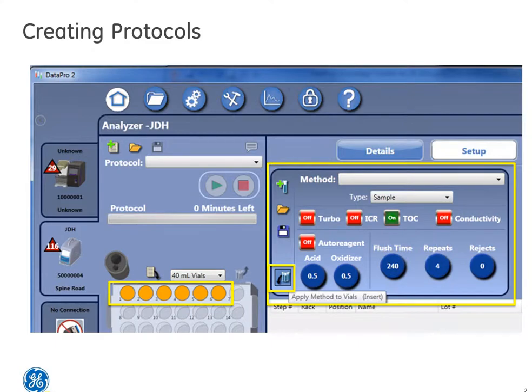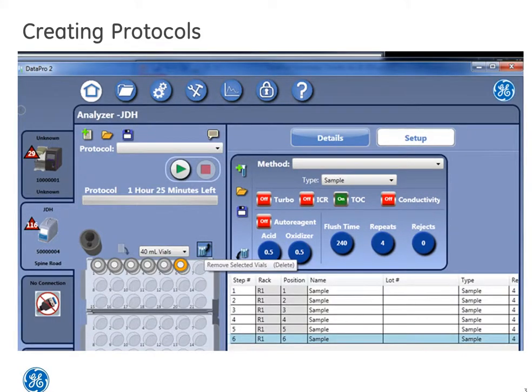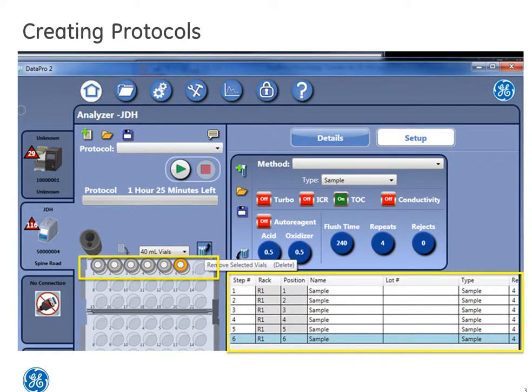After assigning the methods to the protocol, the vials in the auto-sampler rack display will change color to gray, and the results screen will auto-populate. However, if you need to make some edits on sample name or add a lot number, you can edit these fields.